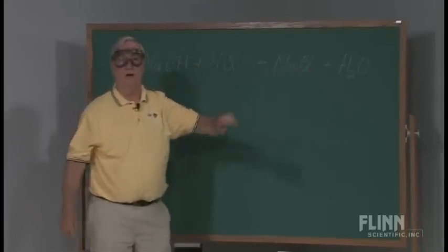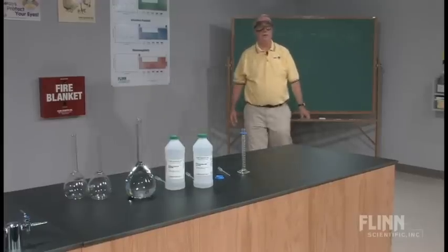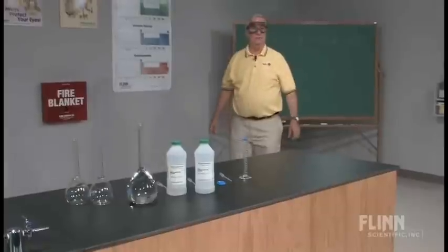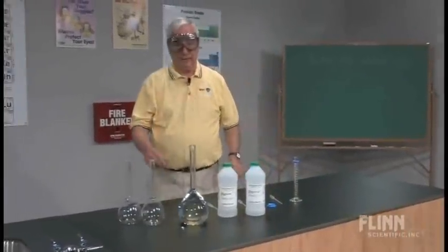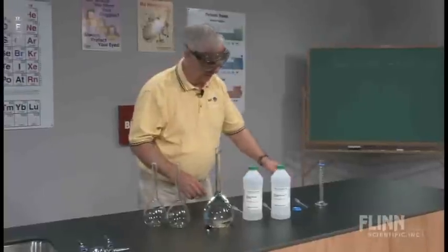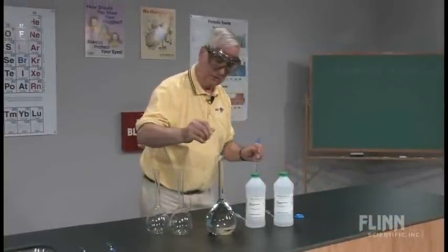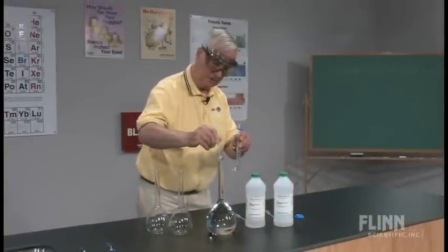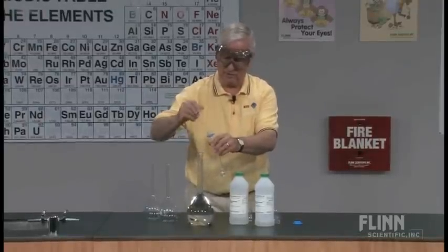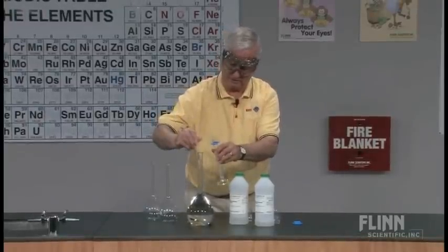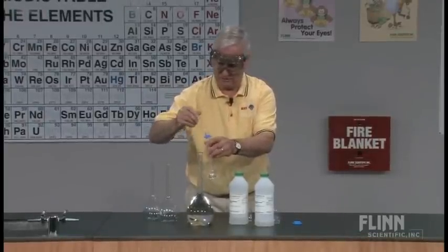Did we in fact create water here? And of course the answer is yes. What I'm going to do is now take the water that was created in the reaction and transfer it to this graduated cylinder, removing the water down to the line of the volumetric flask.